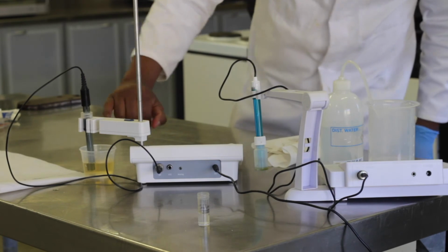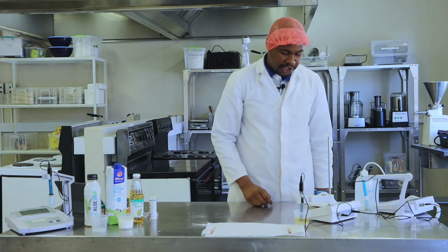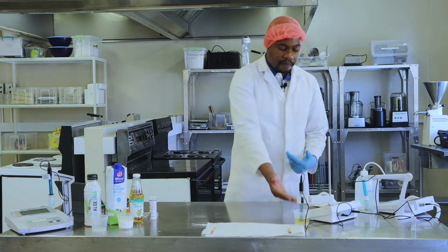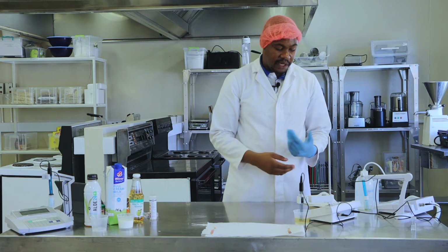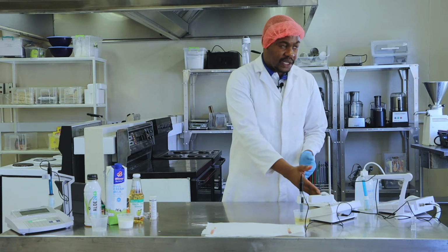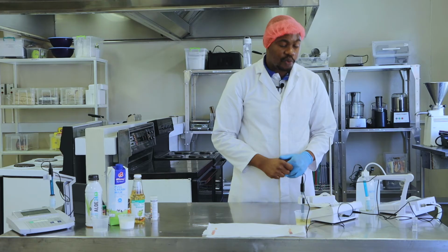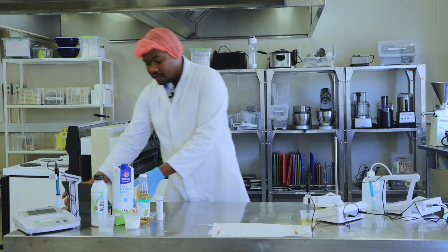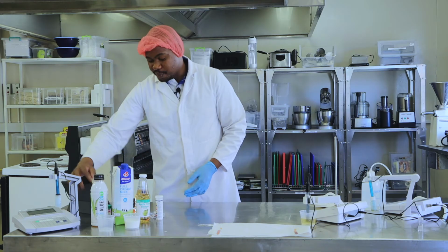And then just make sure that the probe is completely immersed into the solution. Now my pH meter is starting to give me the reading for the apple cider vinegar. And from what I see here, the pH is 2.94. In this case, I'm using my digital notebook.